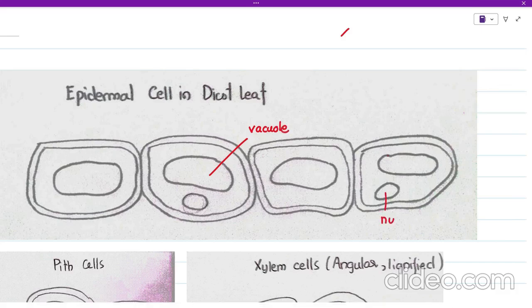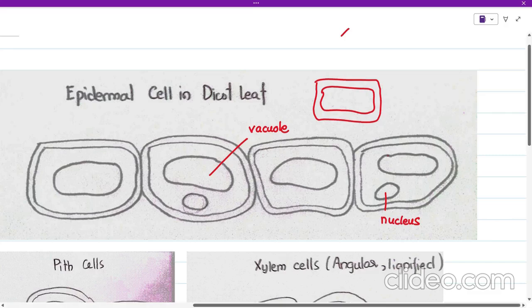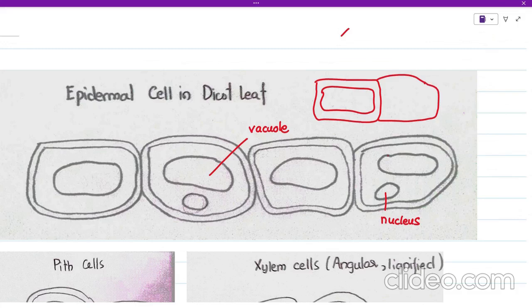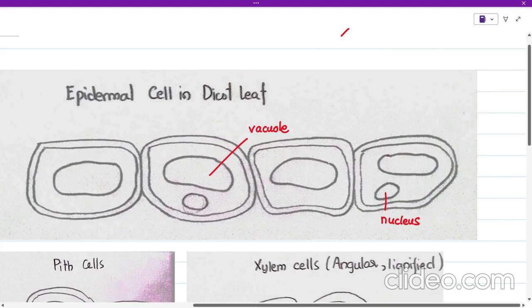This is the nucleus. One important thing: when drawing adjacent cells, the next cell must begin right from where the previous cell ends. Some students draw overlapping cells, where one cell's boundary extends into another — this is not allowed and will cost you marks, as tracing the cell wall ends up inside the other cell. Do not commit this mistake. That was the drawing of the epidermal cells.